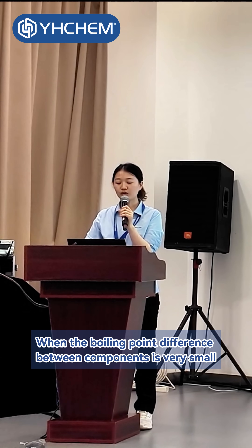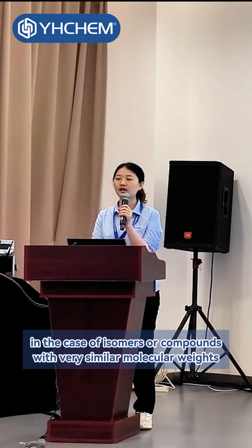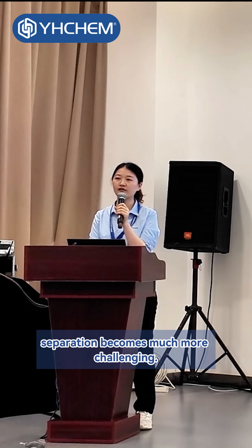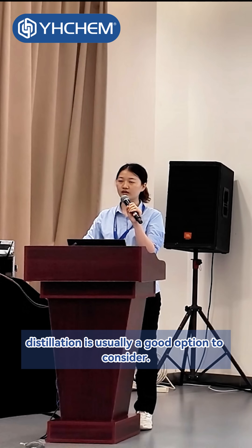When the boiling point difference between components is very small — for example, in the case of isomers or compounds with very similar molecular weights — separation becomes much more challenging. If the material is not heat-sensitive, distillation is usually a good option to consider.